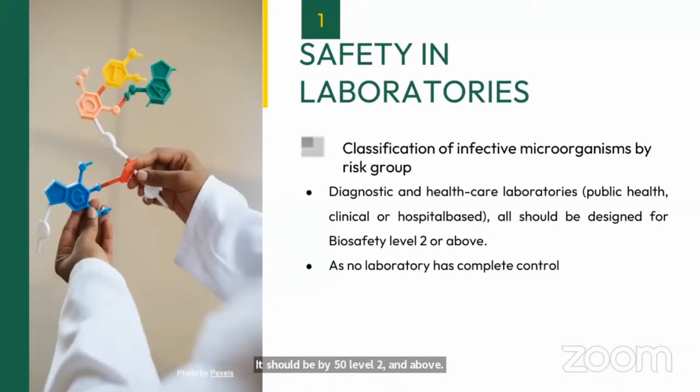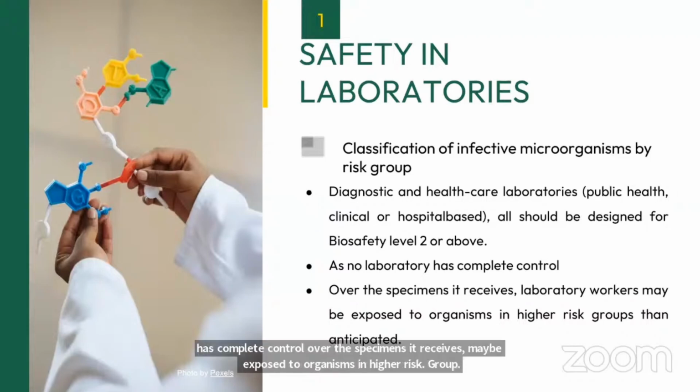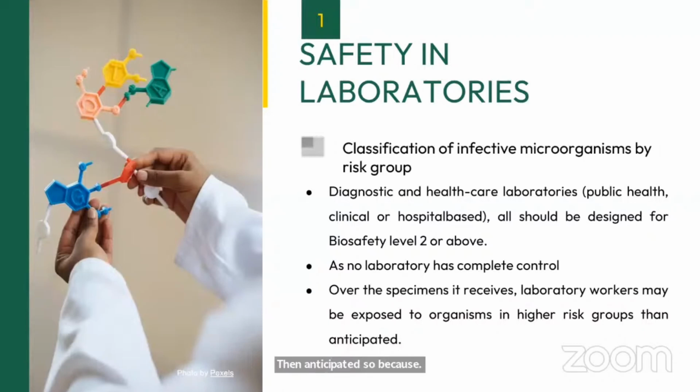As no laboratory has complete control over the specimens it receives, laboratory workers may be exposed to organisms in a higher risk group than anticipated. Many times there is a transfer of staff, there is mixing of specimens, people are traveling, equipment, reagents and documents are moving. So considering all these aspects, you cannot say that a staff member or person is not exposed, or that it is not possible to get exposure to some type of infection. So laboratory workers may be exposed to organisms in higher risk categories also.